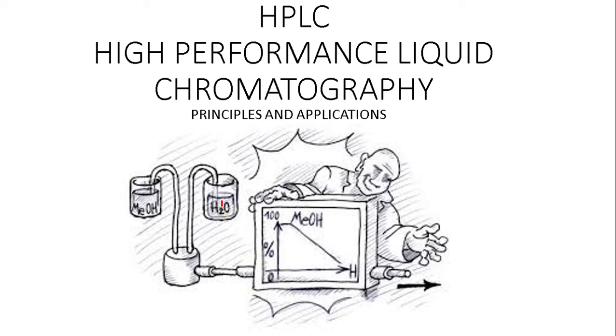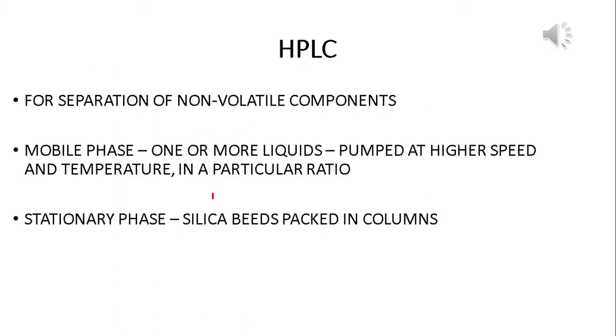So the components we need to separate are soluble in these liquids to different degrees. Accordingly, we separate them. So high performance liquid chromatography.